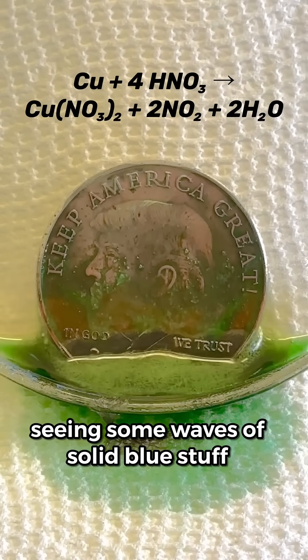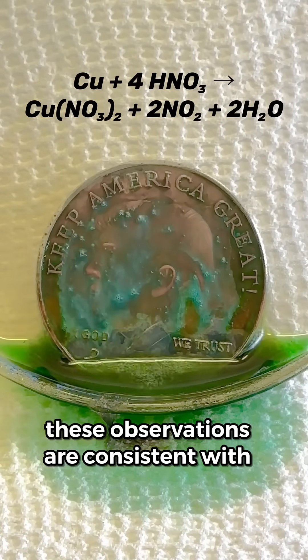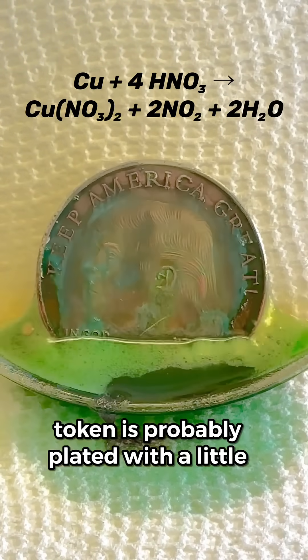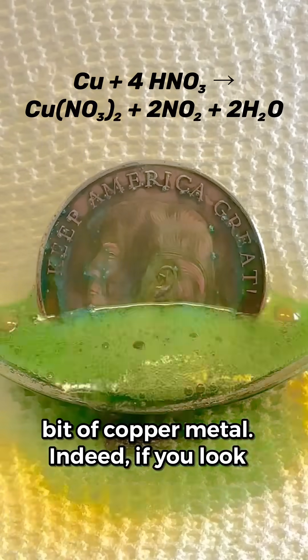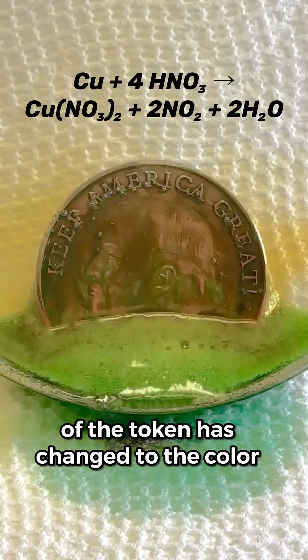I'm also seeing some waves of solid blue stuff forming on the face of the token. All of these observations are consistent with the token containing some copper, so the token is probably plated with a little bit of copper metal. If you look carefully, you can see that the surface of the token has changed to the color of copper metal.